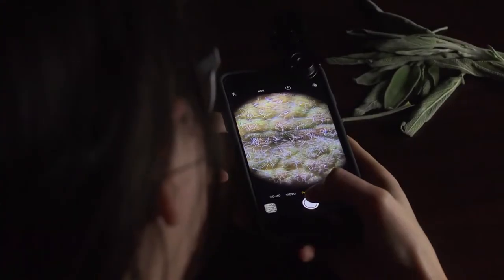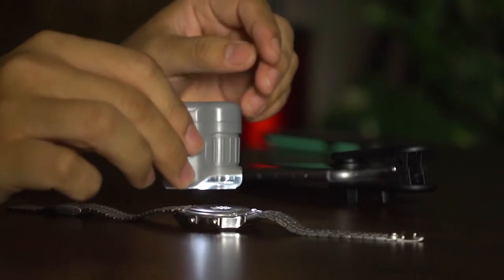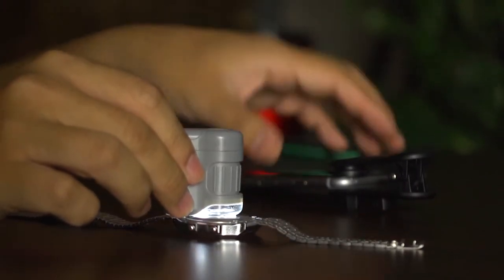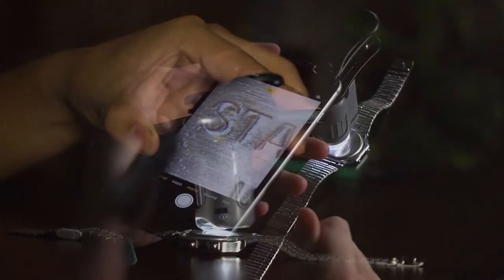If you enjoy looking at plant life this is definitely a cool item to have. The microscope itself allows you to see things 20 times closer than the naked eye. When attached to your phone you'll be able to maintain a sharp focus on details that would be impossible to see otherwise.